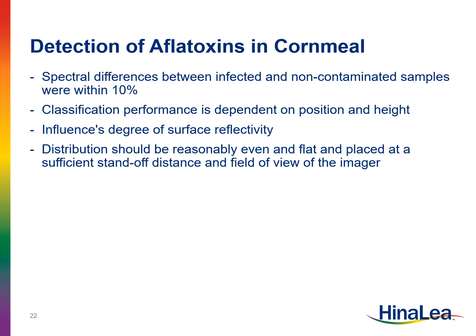We observed that the spectral differences between infected and non-contaminated samples were within 10%, and that the classification performance is dependent on position and height. These influence the degree of surface reflectivity, so the sample distribution should be reasonably even and flat and placed at a sufficient standoff distance and field of view of the imager.